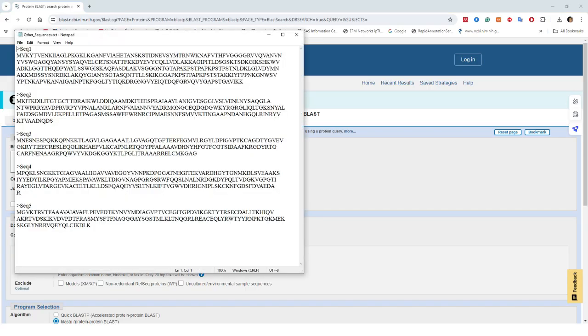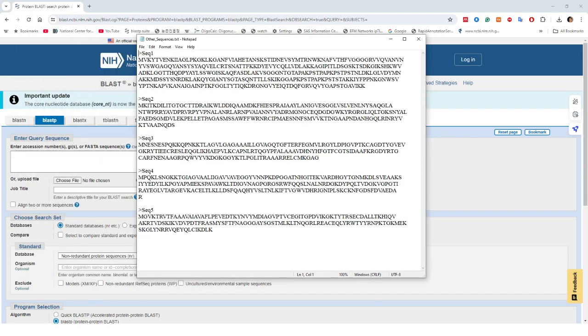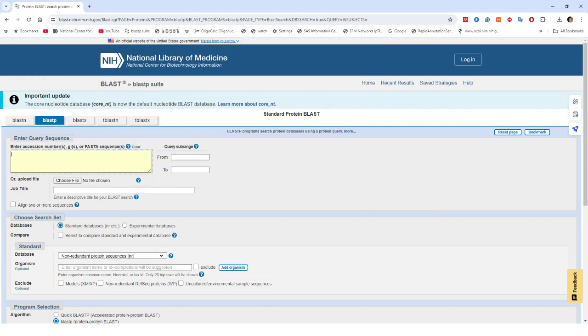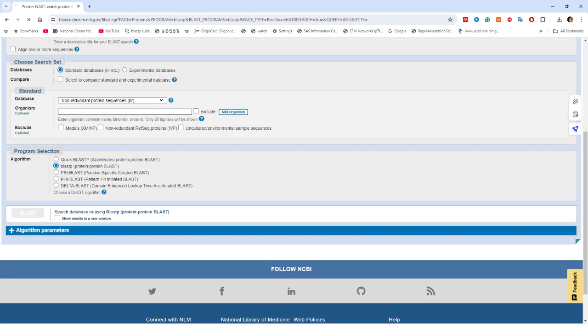Lastly, we can use multiple sequences in a BLAST analysis that would run in a single analysis cycle. Here we have to input all the properly formatted sequences in FASTA format.